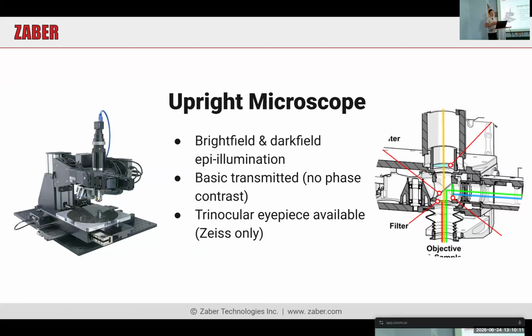We've had people doing parts transitioning between multiple stations, where you have one short travel axis and one long travel axis, so it can move between stations and then move into the microscope and do your imaging under the microscope. Again, if you're automating workflows besides just imaging, we'll show you some examples of some of the other parts that we have that can help you with that.